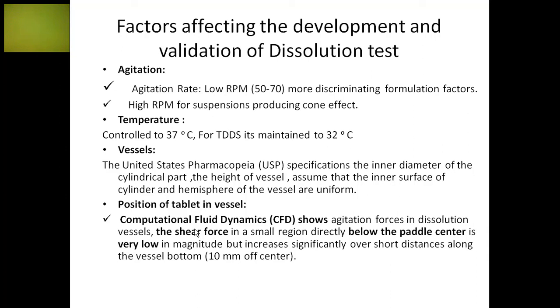Another alternative, which is non-monographic, is using a peak bottom vessel. There will be a peak shape, so even though you put the tablet inside, it will not reach the bottom of the paddle; it will be a little away from it. This enables greater dissolution. But when you make this peak, it reduces some volume of the fluid, so that has to be substantiated.